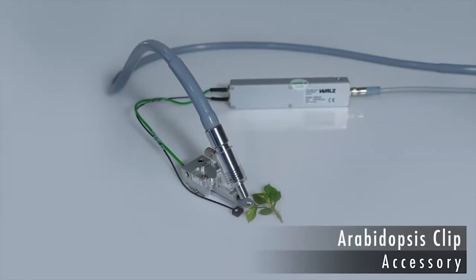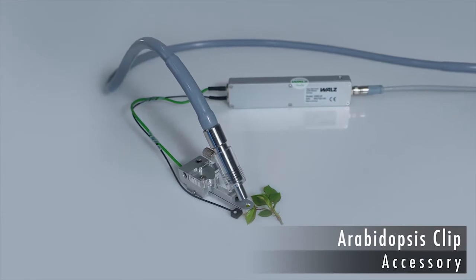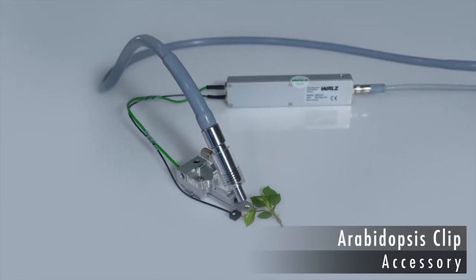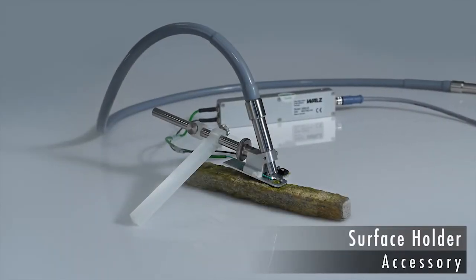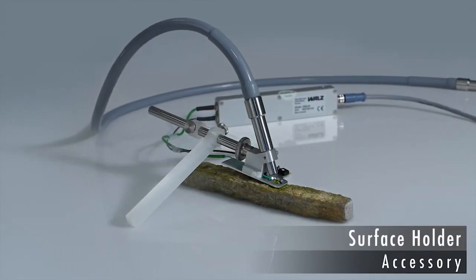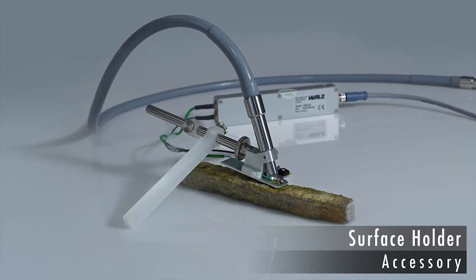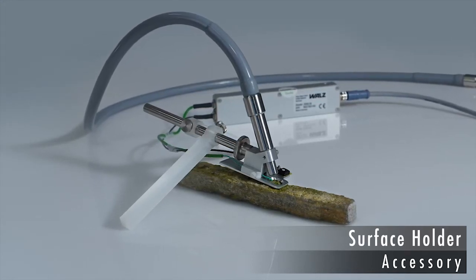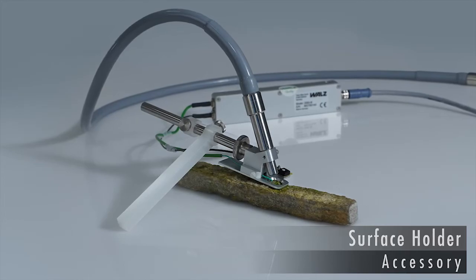The Arabidopsis leaf clip has been designed specifically for measuring small leaves. The surface holder is a positioning device for the fiber optics. It is most often used in studies of mosses, lichens and photosynthetic crusts.